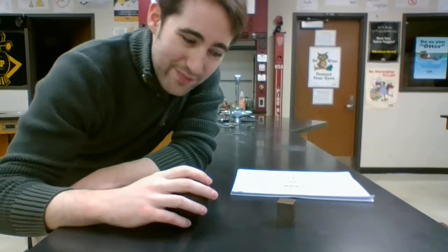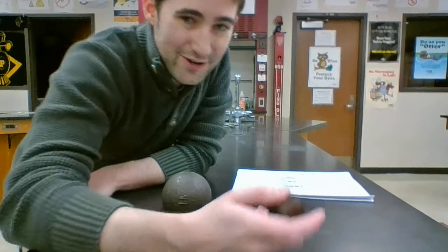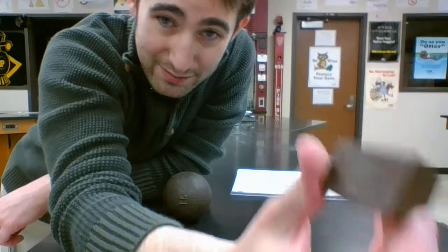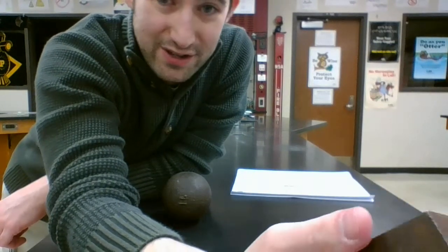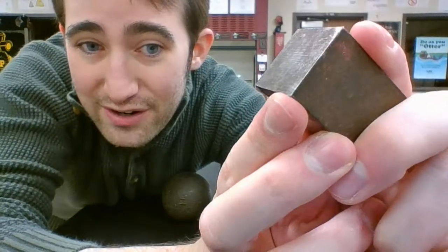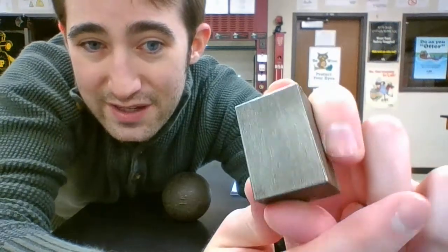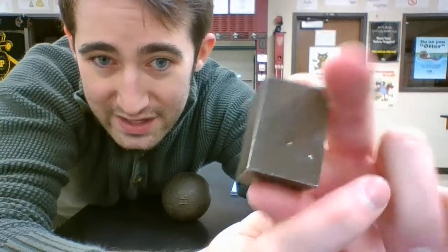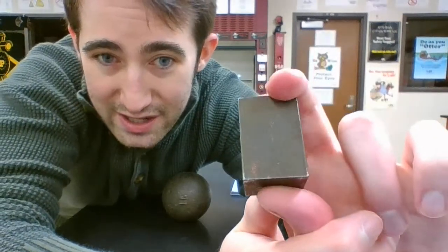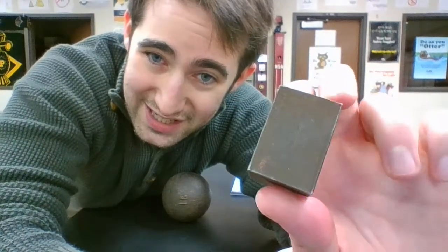Now also, based on that difference in color, you can figure out whether this is a physical change or a chemical change. So, even though we're not seeing the rusting process in motion, in action, it's a pretty slow process, you can see the before and after. So on the corner here, this silvery bit, or on this edge that I've polished right here, you've got kind of the before, and then on the flat edges, you've got the after, this sort of reddish brown, dull color. So you can use those to figure out whether this went through a physical change or a chemical change to get here.